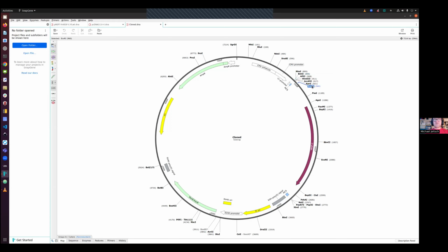And of course, if you use a frequently used restriction enzyme, it is not only cheap, but you will also typically find it in the fridge. So this is just a sample. How do you know? Of course, if you haven't done any cloning, you don't know which enzymes are frequently used and which are not.